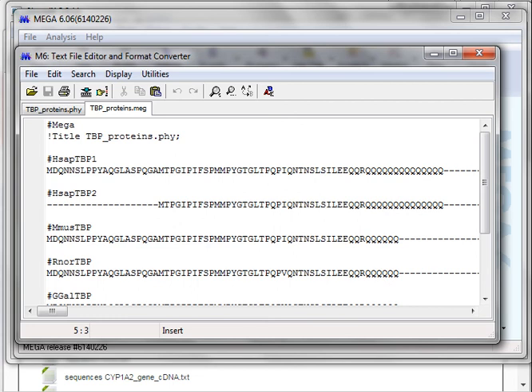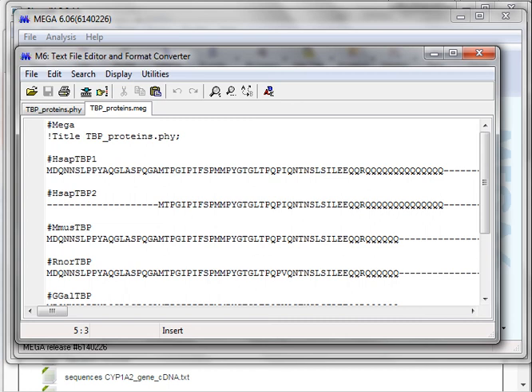OK, you have your file saved and now you can perform your phylogeny. You can construct using different methods. Maximum likelihood that is based on characters or a distance based called neighbor joining or minimum evolution. You also have UPGMA or maximum parsimony as maximum likelihood based on characters. Maximum parsimony and maximum likelihood, they are more expensive in computing. Neighbor joining is more common as also UPGMA that is more computer light. So we will use neighbor joining.